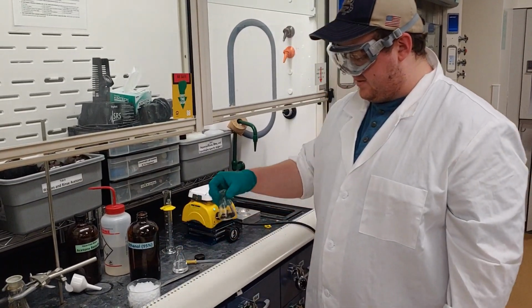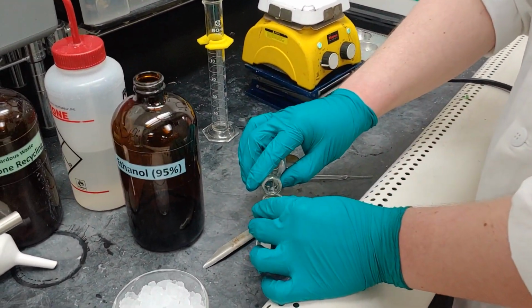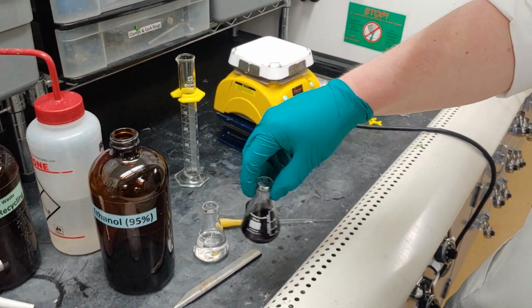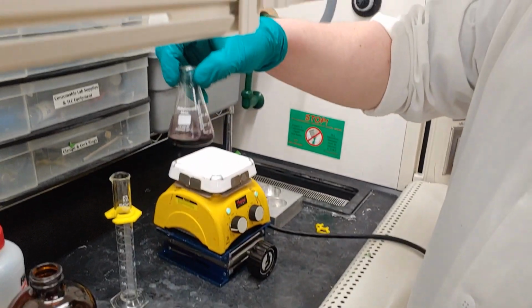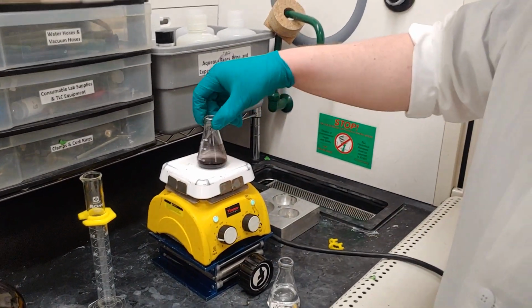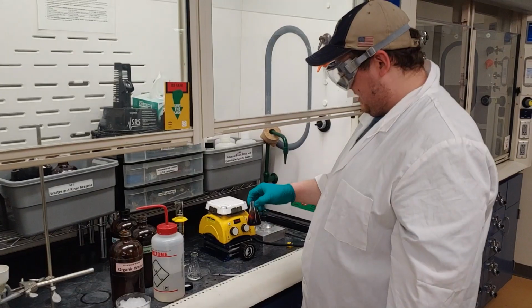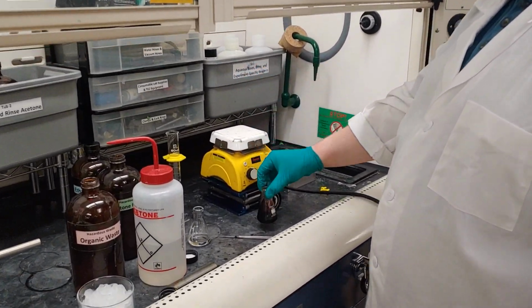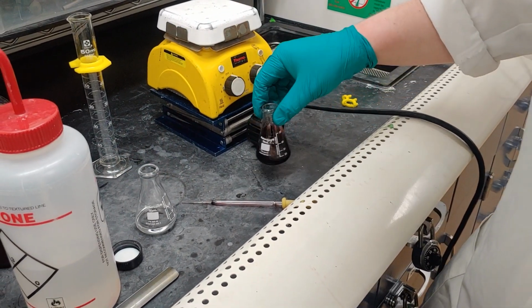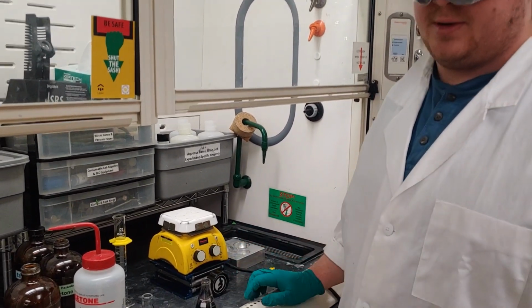So now that I have the solid filtered and in a flask, I'll add a small amount of this 50-50 toluene and ethanol mixture. So what I'm then going to do is heat this and continue adding the ethanol toluene mixture periodically until the solid is completely dissolved. So now that I've been heating this and I've added roughly 35 milliliters of the toluene ethanol mixture, I am finished heating, so what I'm going to do is slowly cool this down to room temperature.